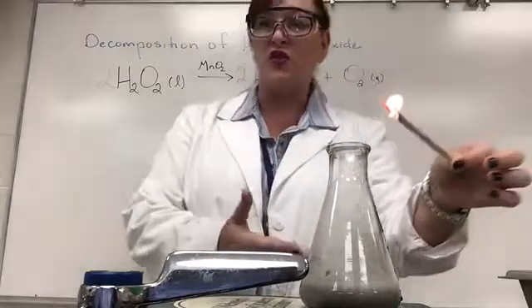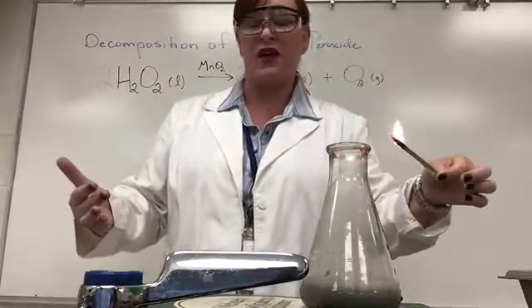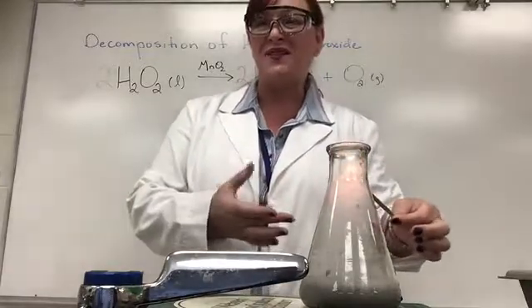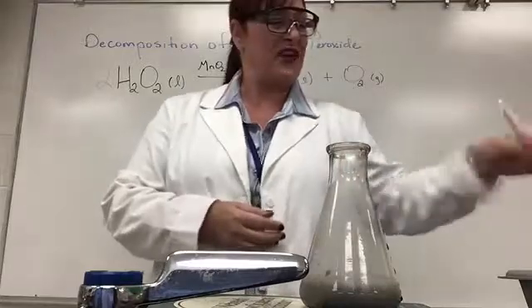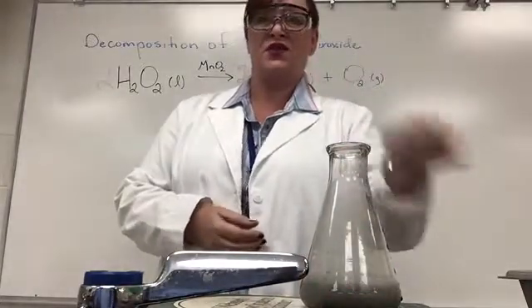So that's a test you can do for oxygen gas, because of course oxygen gas is part of the fire triangle. So by adding a little oxygen to this smoldering splint, I can reignite that flame. And I could just do this all day. This is just super fun. Chemistry is amazing.